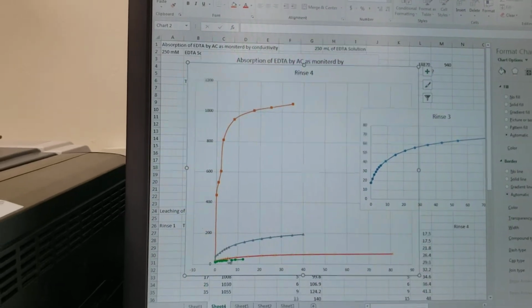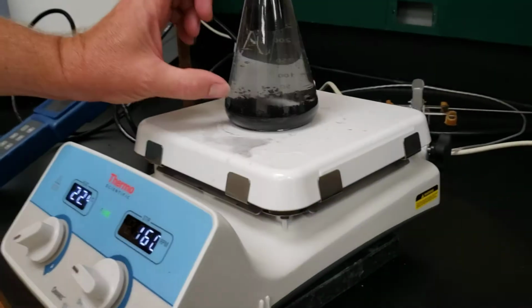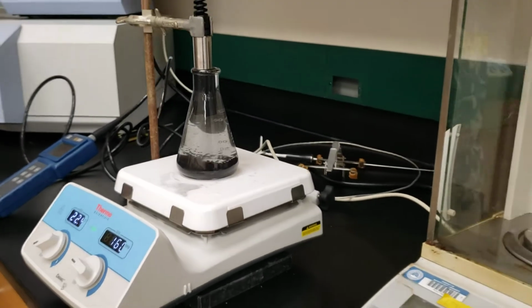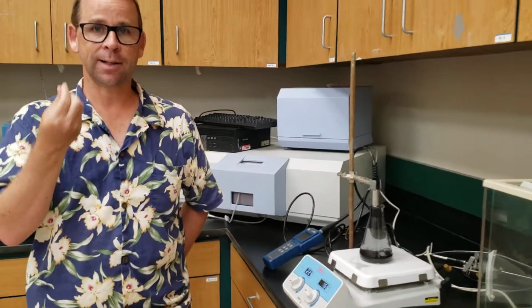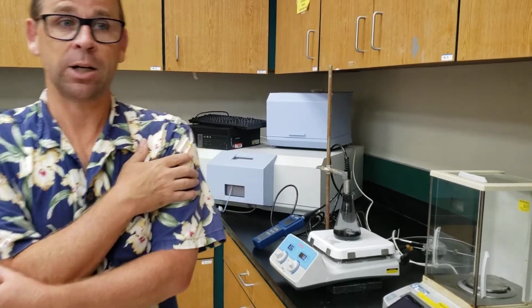After this rinsing, which is constantly stirring like this, right? So we have activated carbon with EDTA on it, constantly stirring in water. This material up here, this supernatant, becomes black, right? We ran it in the centrifuge again this time and couldn't centrifuge the material down, so the material is very light. I don't know exactly what it is. It's probably little tiny particulates of carbon for sure. Whether it has EDTA on the outside, I don't know.